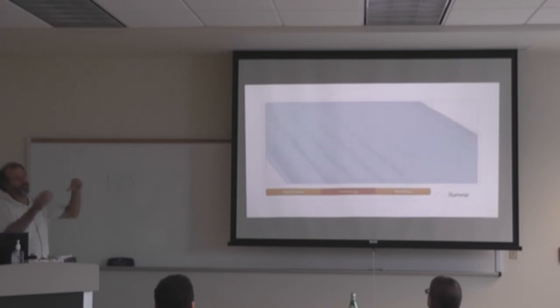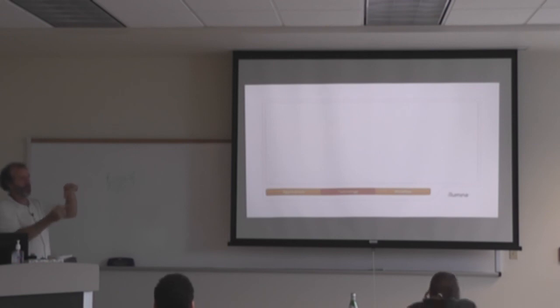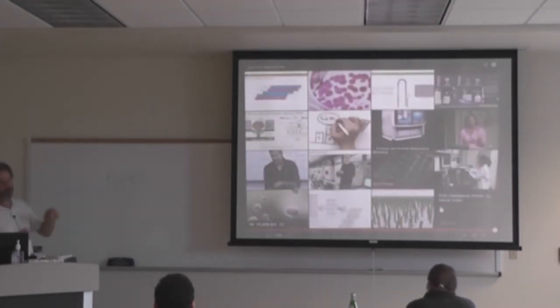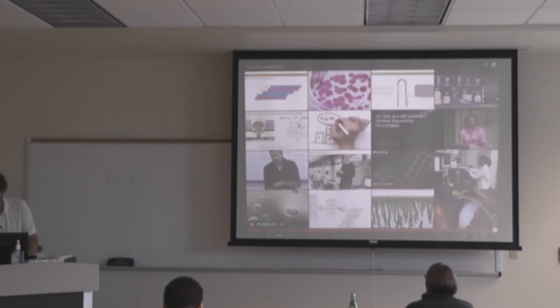So they have a fluorescent label that blocks that 3 prime OH group. So it basically protects it from being added. And they compete, different colored fluorescent labels. So then you add that, read the fluorescence, you can remove that protecting group, and then continue with the next reaction. So that's how you can sequence basically a genome in about a day, with those two methods.